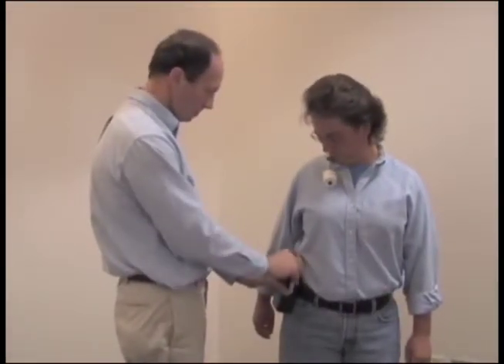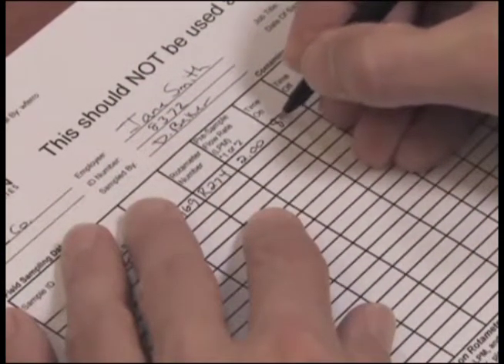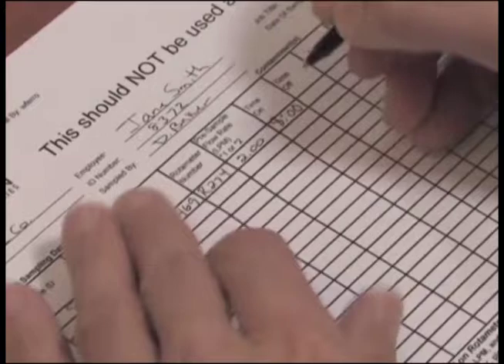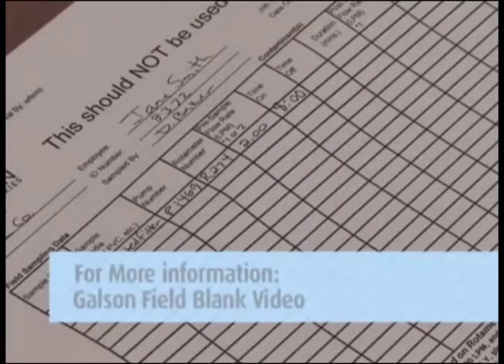Turn on the pump and record the time to the minute that you started the pump. The counter records the minutes the pump is operating and should read zero when you start the test. A field blank cassette should be collected for each sample set and should accompany the actual sampling cassettes during all periods except actual sampling.